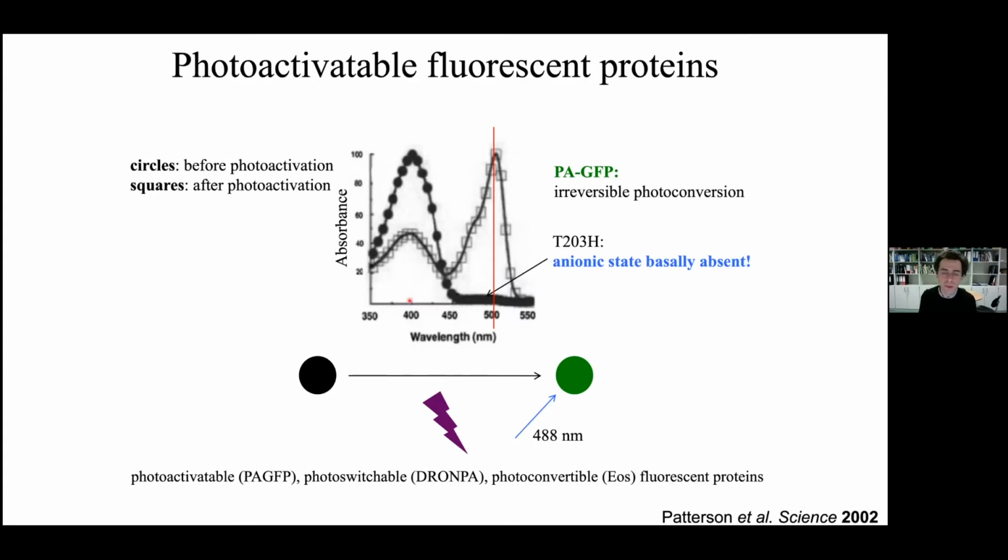For those who have a bit more experience in spectroscopy, basically you can trigger the chromophore of this fluorescent molecule to switch from an inactive state, where you see here that you don't have a band, so to say, to a state which can actually be excited, the open squares, where you actually have an excitation band.